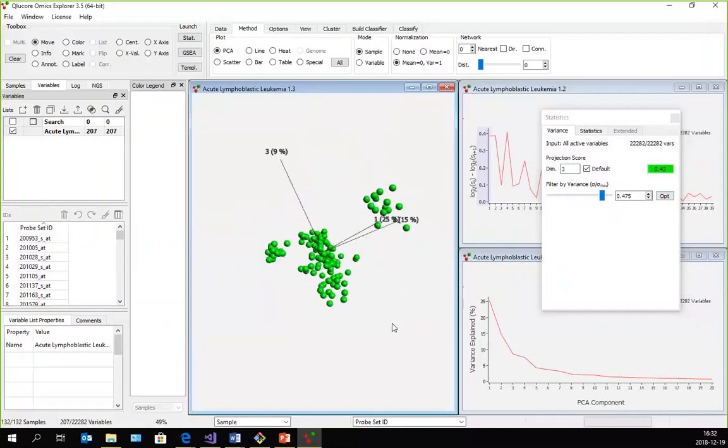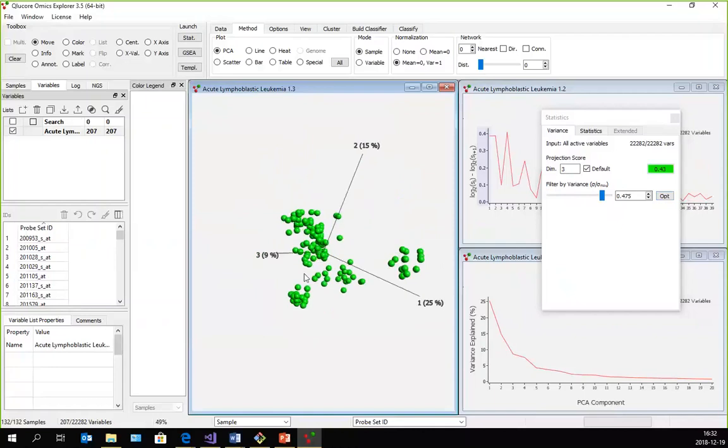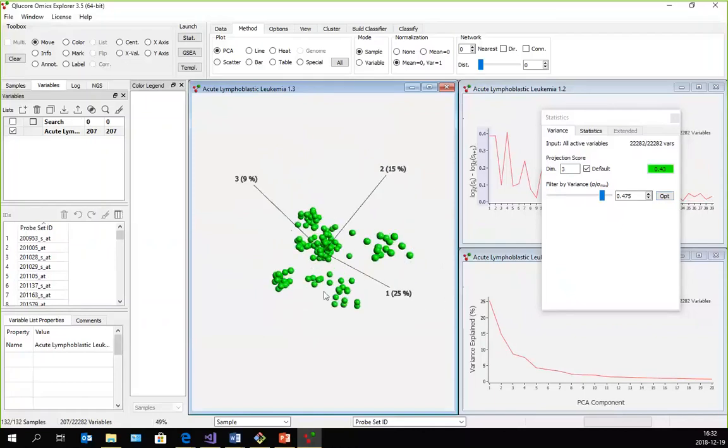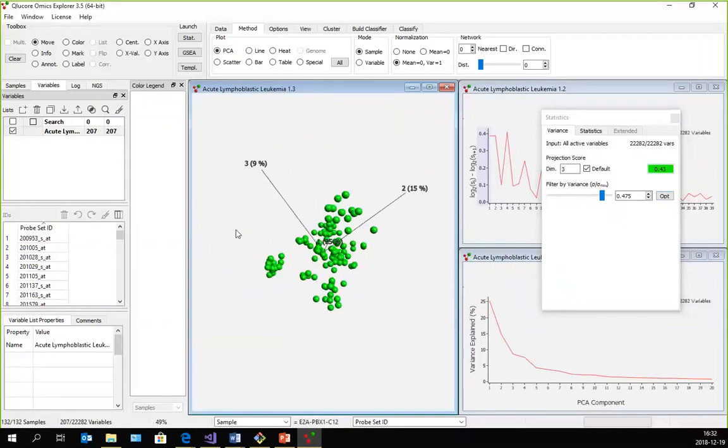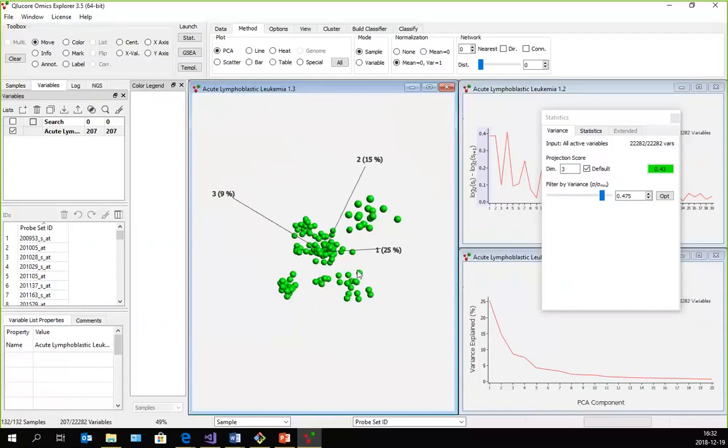And in this case, it gives us a good value because what I have here is a leukemia data set. Acute lymphoblastic leukemia has two main types. There's one of them, there's the other one. It's very obvious. And this second type has very many subtypes, and it is even distinguishable from this plot here, that we can see at least one of the subtypes here very clearly, and possibly another one here.